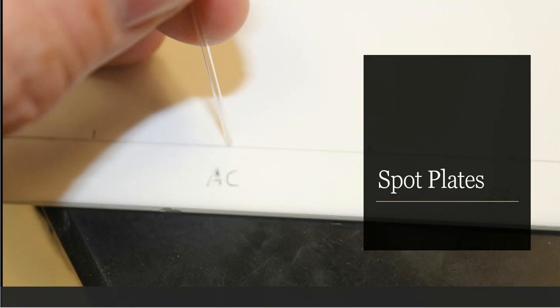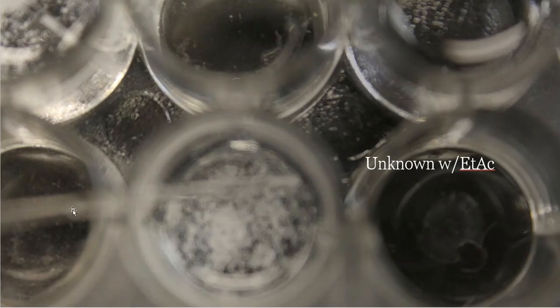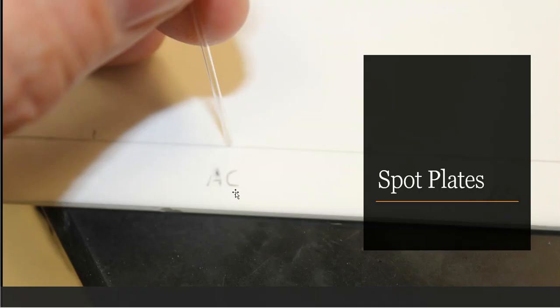All right, so now we've got to go through and we've got to spot these plates. So down here at the very bottom, I've ticked these off with tick marks and I've labeled each lane the way that they need to be. And I took a capillary tube. You can kind of see that one here in the bottom. I just dunked it down into that solution. Some of the liquid sucked up into the capillary tube. And now I just need to dab it onto that plate at that particular location. So one little drop, that's all that you need for this thing to work.